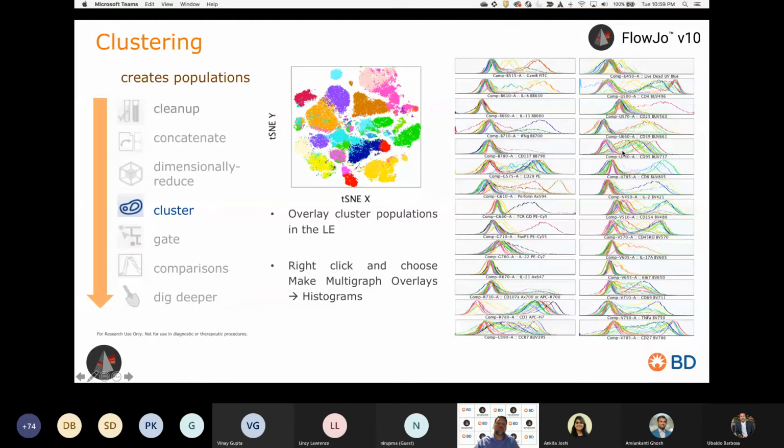And so again, this is an alternative way. You can manually gate for everything you know in a hierarchical fashion in these data. It gets complex when you have 28 colors, right? But that's still, you know what you're looking for and what the question is you're asking for your experiment. Making a dimensionality reduction view gives you an overview of all that data, gives you a data space to explore, and then running a clustering algorithm simply subsets in an objective way, not a subjective way, right?